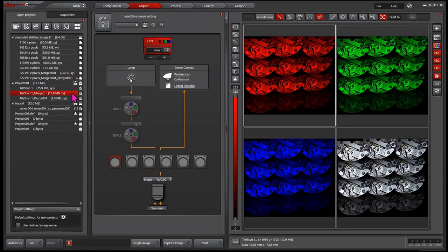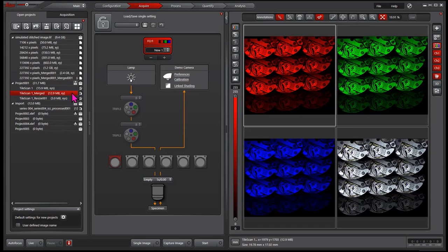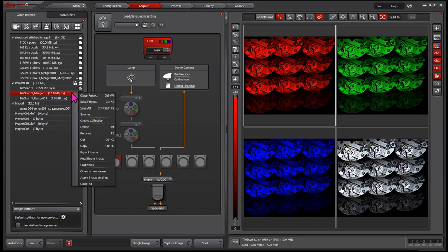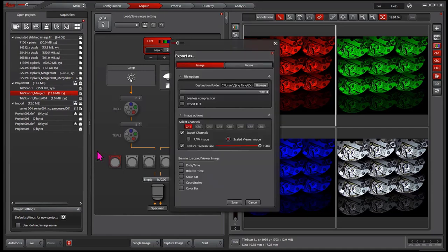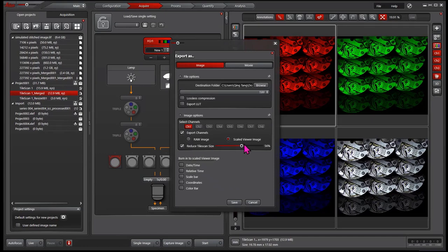One is during export. You have a choice to reduce the tile scan size. The exported TIF will have the smaller pixel size and the file size. I have a simulated picture here. Right-click and export the image. You will see a reduced tile scan size here. Use a slider to change from 1% up to 100%. Click save. You will have the reduced file size and image size.